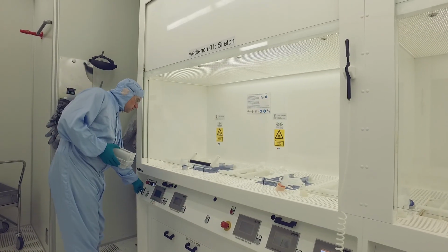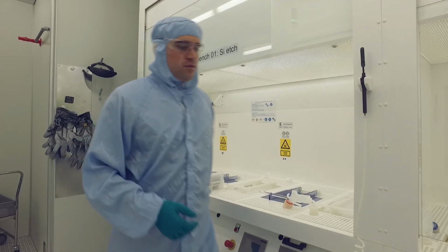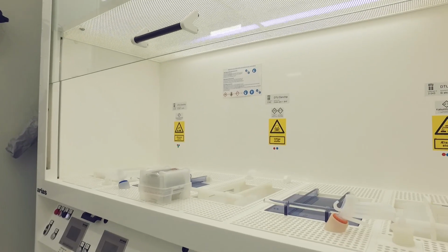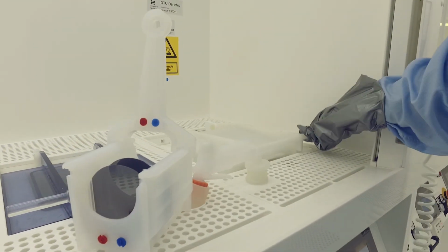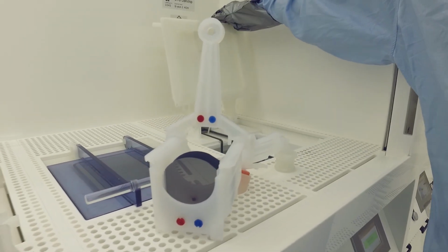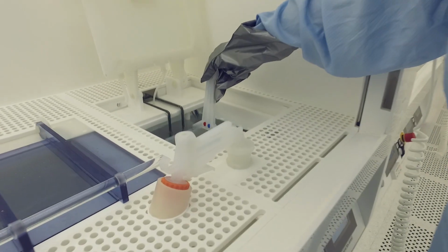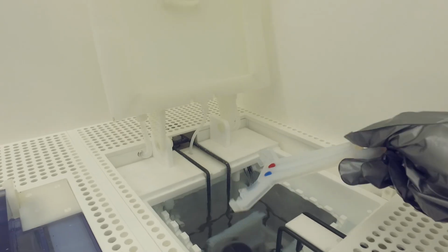When opening a wet bench sash, it's important to use the buttons on the front panel to provide time for the ventilation and HEPA filters to start up before the sash opens. When you process samples in baths, it's important to use the correct boat which is dedicated for that specific bath. The coloured dots show which boat and bath match together.